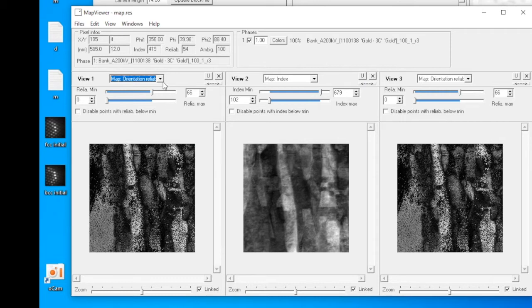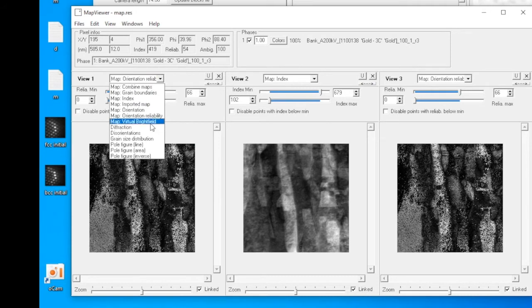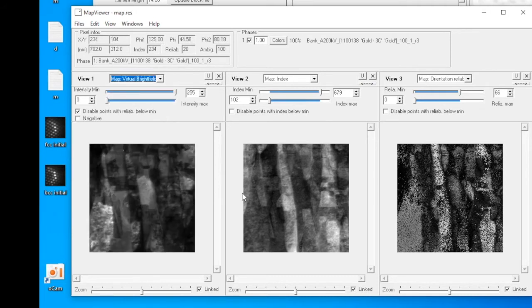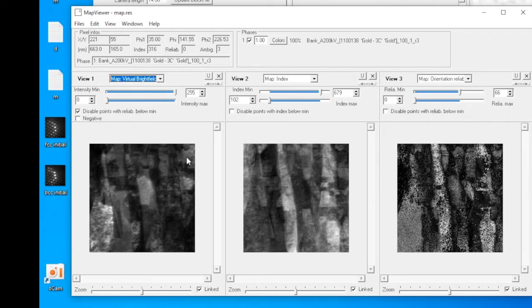The next is the virtual bright field image. In the virtual bright field image, it uses the intensity of the direct beam to form the micrograph. So it's very similar to the bright field STEM image you acquire.